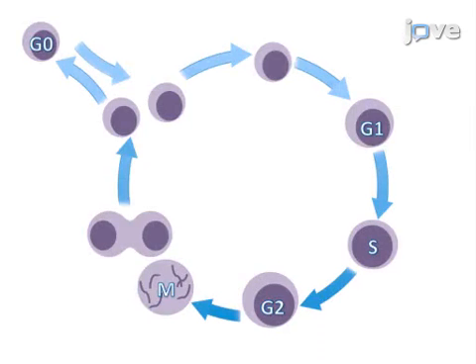This problem can be overcome by incubating the cells with a pulse of BrdU, a thymidine analog, to label cells in S phase. The labeled cells can be tracked through the cell cycle by harvesting at selected times after the removal of BrdU.